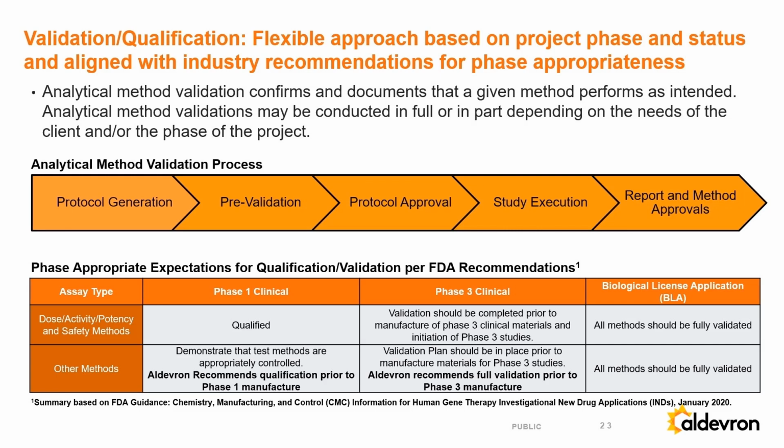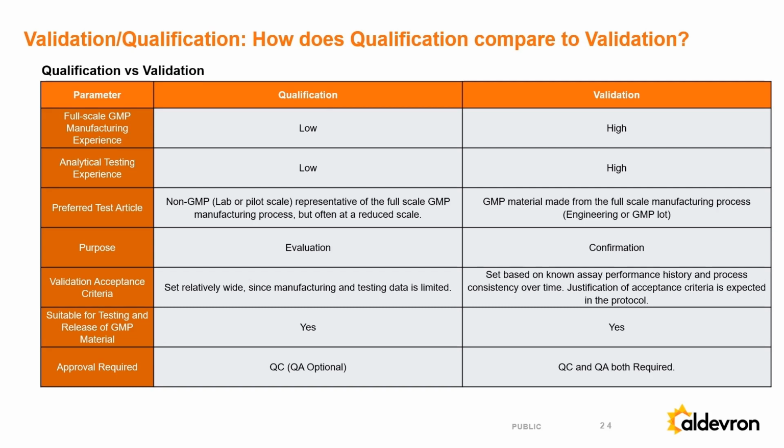What we'll talk about today is more in line with a platform validation, with the idea of laying that foundation so that product-specific, partial qualifications can come through to expand the scope of our platform method.